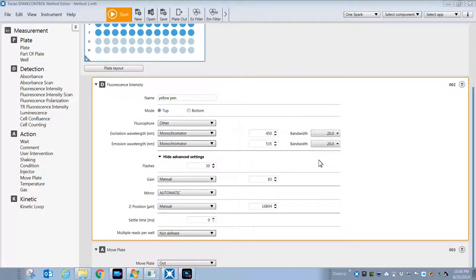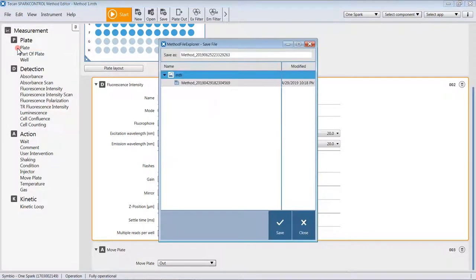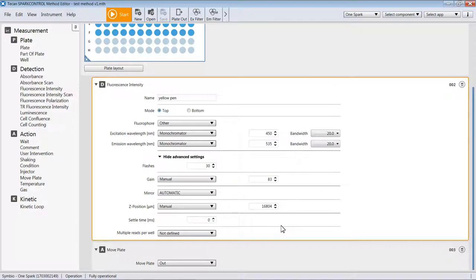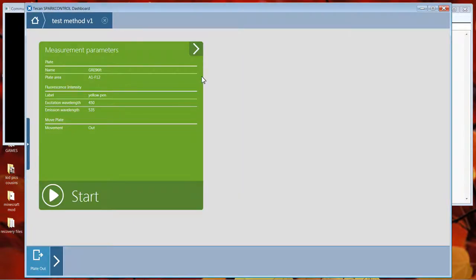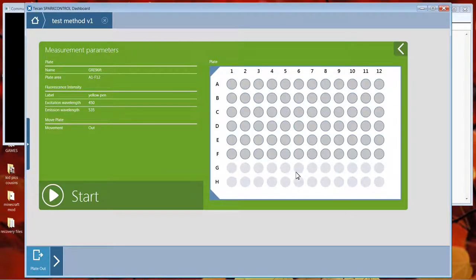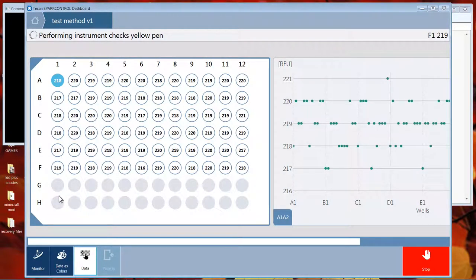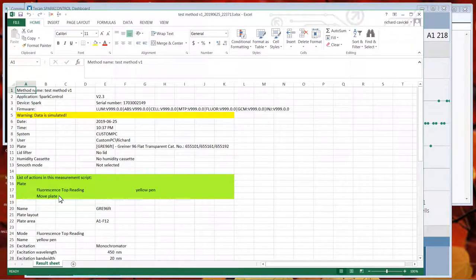Once you've arrived at some settings that you'd like to keep as a method, you can go up here to File and choose Save As. You can enter a name for the method. I'm just going to name it something like Test Method Version 1. When you hit Save, the software will populate the dashboard with a tile. You can see it here called Test Method Version 1. If you were to click this, it will bring up the method to run. You can open this part here and see which wells will be measured. When you press Start, it will go right into reading. Now this is a simulation, so everything's happening quite quickly. You can see that you get your data here and then you export to Excel.